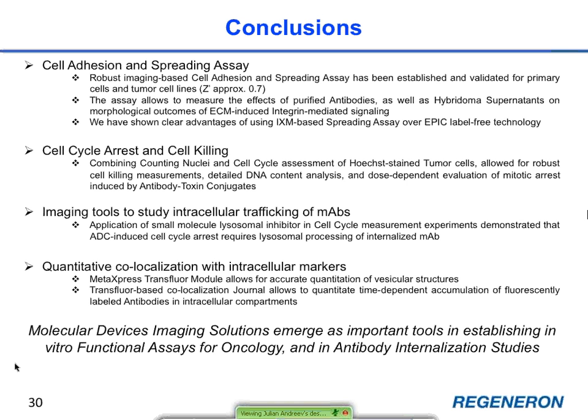We have established and validated imaging tools to study intracellular trafficking of antibodies, and we apply a small molecule lysosomal inhibitor and cell cycle measurements to demonstrate that ADC-induced cell cycle arrest requires lysosomal processing for some ADCs. We have shown that the MetaXpress transfluor module allows us to acquire quantitation of vesicular structures, and transfluor-based co-localization journal allows us to quantitate time-dependent accumulation of fluorescently labeled antibodies in intracellular compartments.